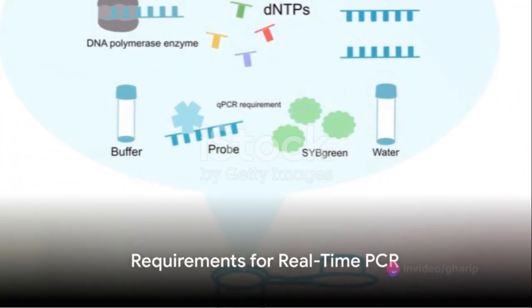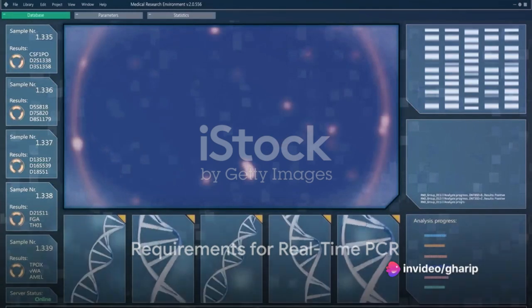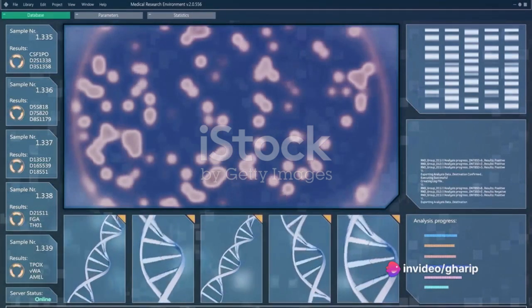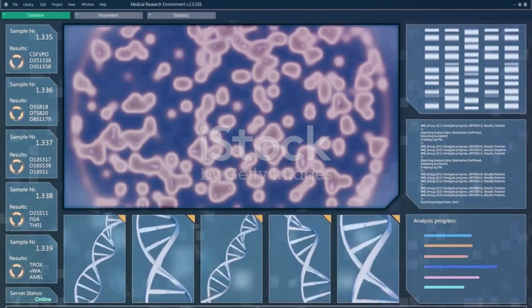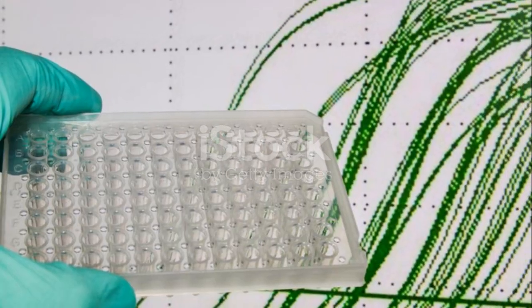The requirements for conducting a real-time PCR include a DNA template, CyberGreen master mix, gene-specific primers, nuclease-free water, optical PCR tubes, and of course, an ice bucket and DNase RNase free tips.